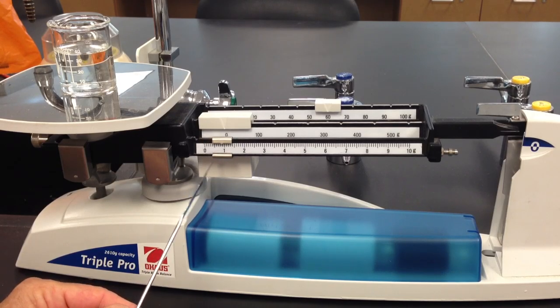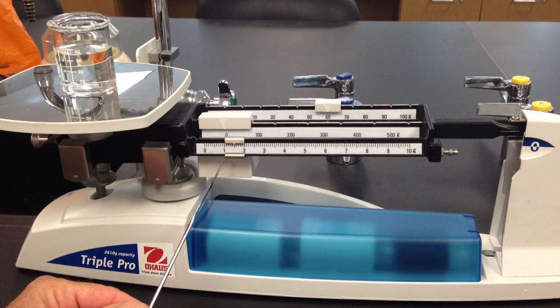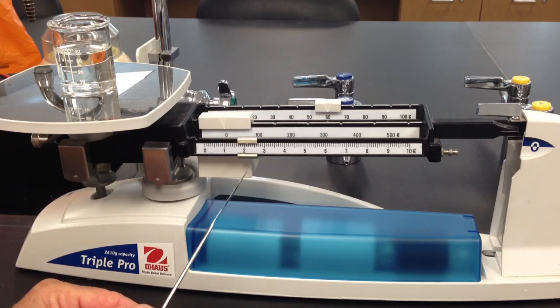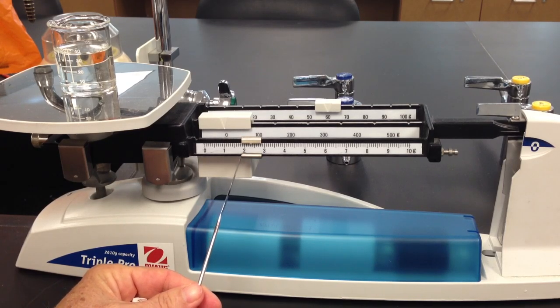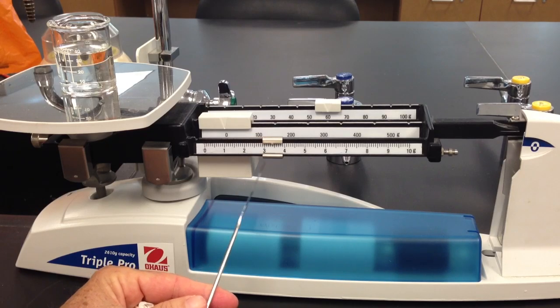You just freely slide this beam—this is where you're fine tuning your measurement—until you get the balance beam to balance to the zero mark at the end of the beam. We're going to continue sliding.